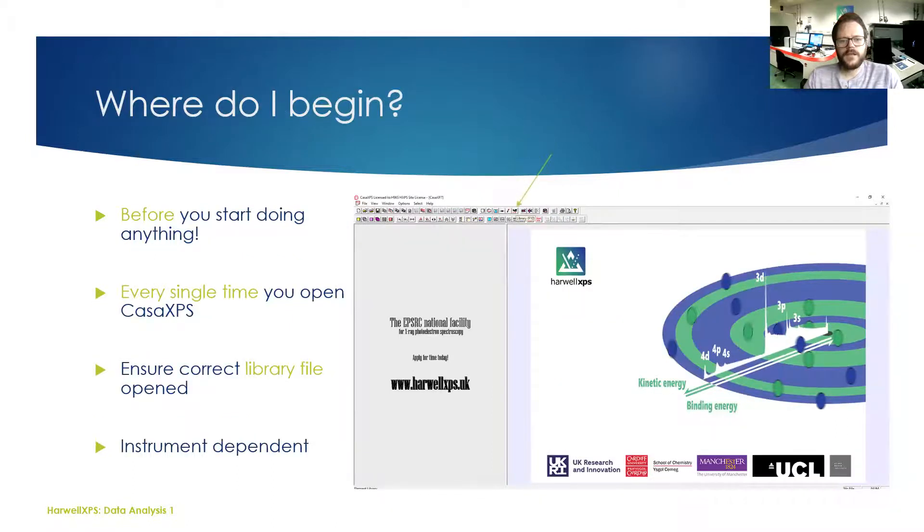This is a very important step and people can often overlook it. Sometimes it can slip your mind, but it is very important that you load up the correct library file. Different instruments will have different sensitivity factors, and there are library files associated with the different instruments that will load up your calibration values. If you're just getting data from someone, check with the experimental officer which library file you need.